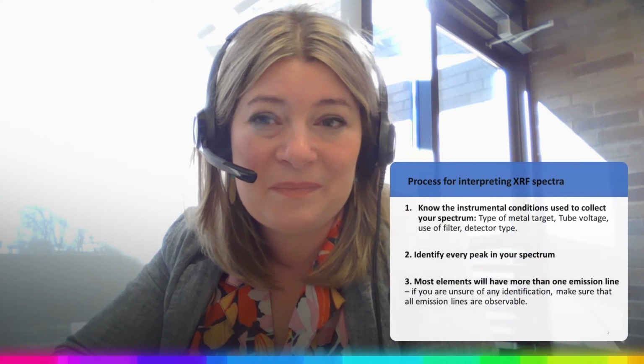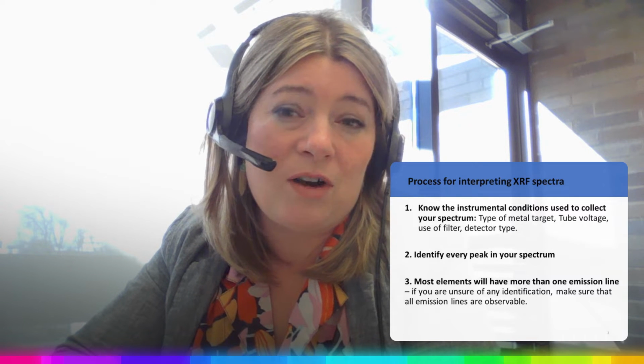In this final mini lecture on XRF, I'm going to talk about some of the nuances to interpreting XRF spectra. While XRF spectra can look simple, and with the use of an emission peak table, assignments can be easily made, it is also easy to make incorrect peak assignments and identify elements that are not present, or to miss elements that are present. Here's a process to avoid mistakes.